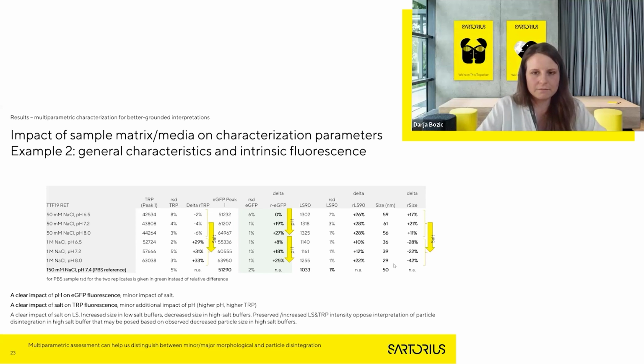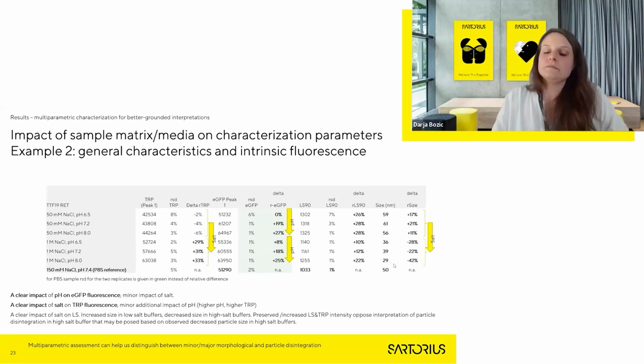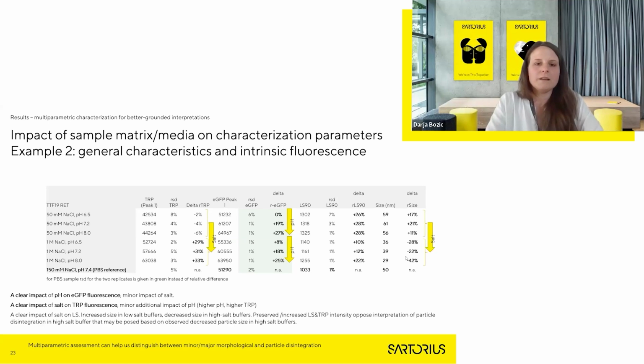The chromatograms display signals for various markers. Is it possible to incorporate multi-labeling into the described approach? Basically, our setup allows detection of at least two different fluorescences. If needed, another detector with another two fluorescence channels can also be added.